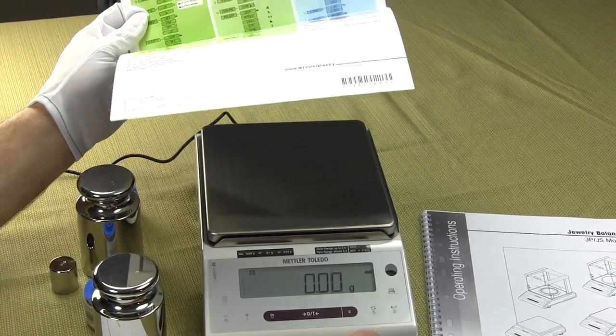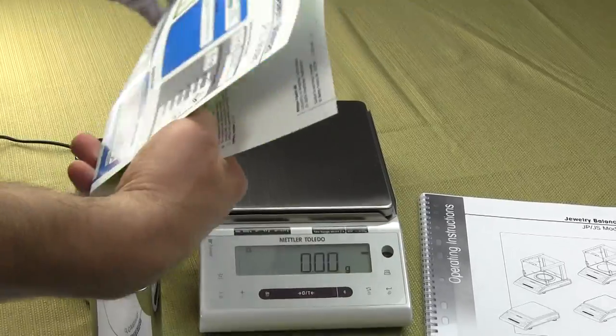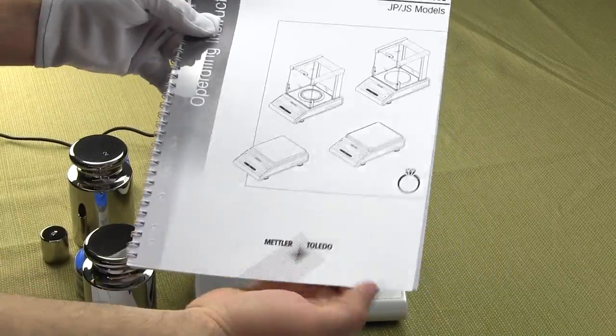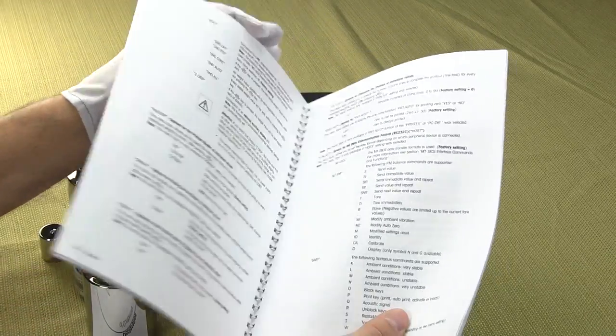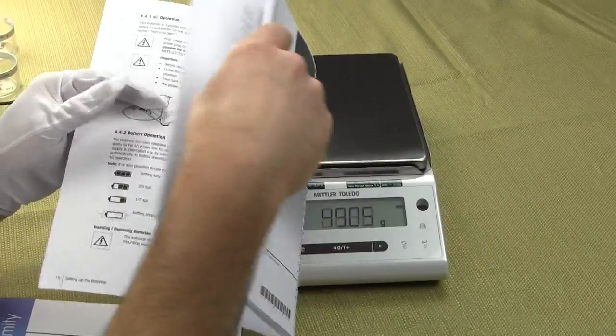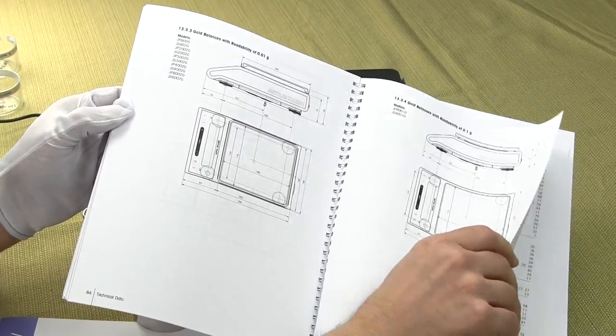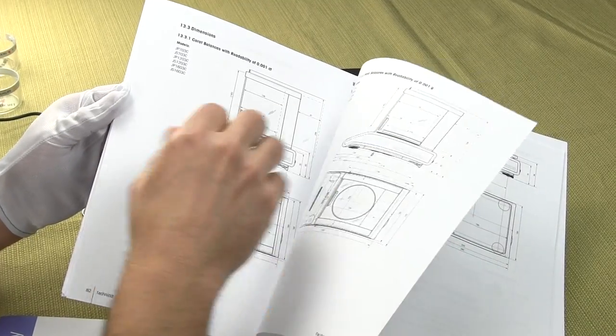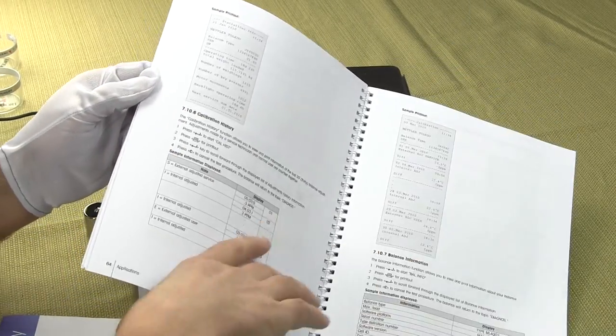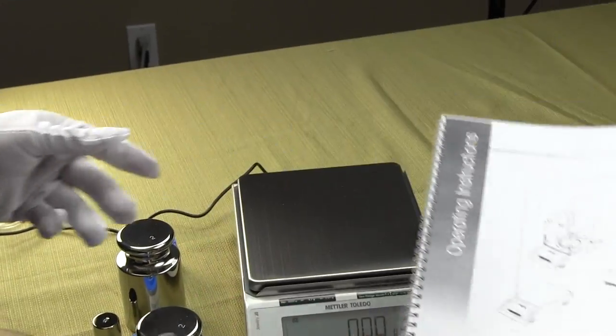Clear returns. So Mettler provides some great documentation. And this one letter sheet here will explain how to use the balance. Mettler also provides an extremely well detailed manual. In this manual here, you name the settings, configuration, the book clearly explains all of the settings. Towards the rear of the manual, you have a nice index, dimensions of the balance. And there is a section showing all the optional accessories. So Mettler is doing a fabulous job in regards to documentation, any kind of configuration, step by step.